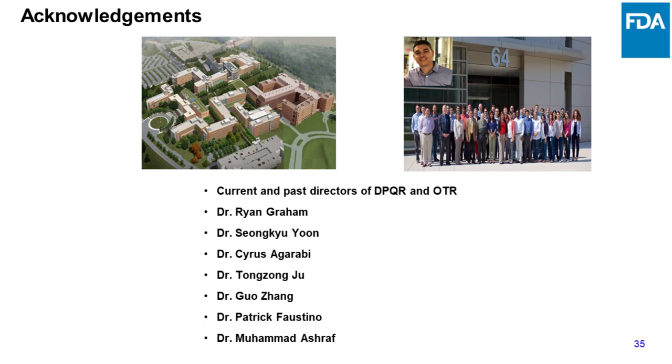And do you notice any matrix effect when samples of high salts were analyzed? Was the internal standard used to correct for this effect? Yeah, I think it is clear from my presentation that the internal standard is always there because it's continuously running through the prepFAST. I have not used samples of very high salt so far. Maybe Madhav can correct me. He's the biologist, he does the bioreactors. But I believe I have not used very high concentrations of salts. In those cases, I think I would have to dilute a lot, at least 100x, so I think it is okay. But I have always been using the internal standard.